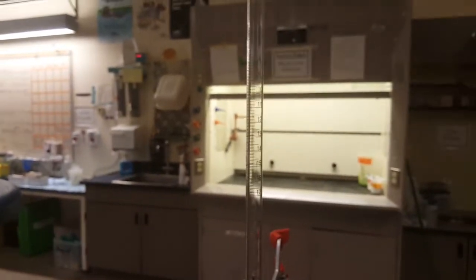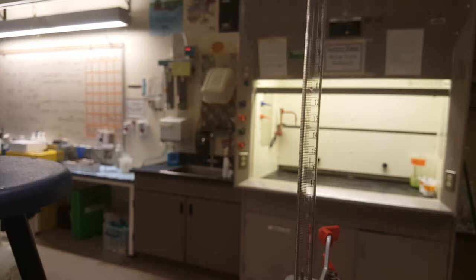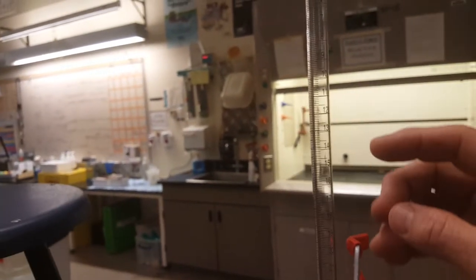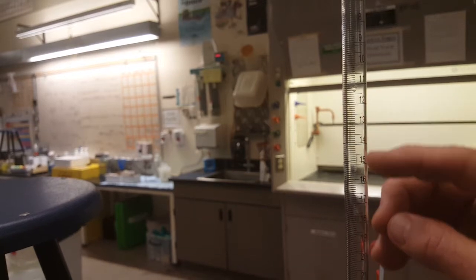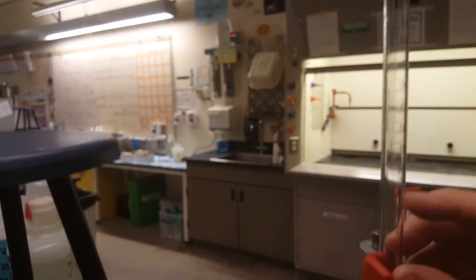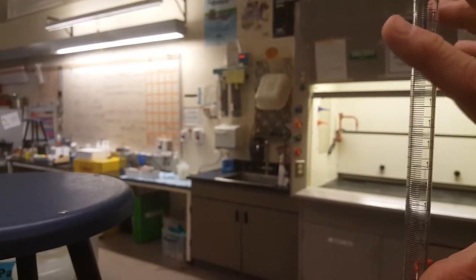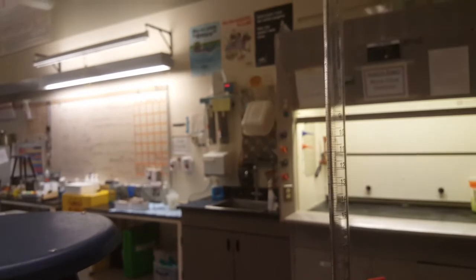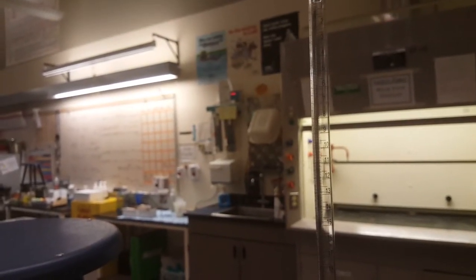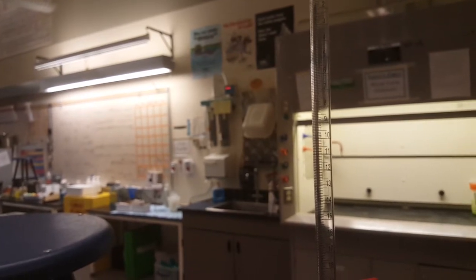And then you'll drain the sodium hydroxide out of your burette during the lab. It'll be going down into your beaker at the bottom where your acid is until you neutralize the acid and hit equivalency. And then you'll have a final volume. So your final volume minus your initial volume will be your volume of base. That's how to use a burette, and knowing how to do that is important on the American Chemical Society National High School final exam.